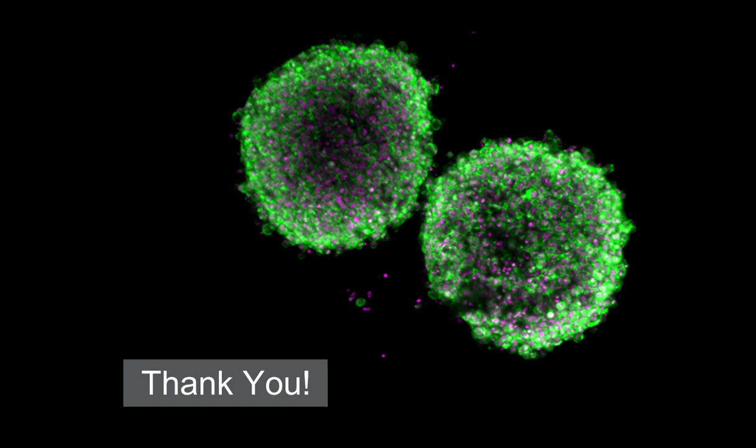Yeah, thanks, Christy. Another good question. All of the different assays, reagents and dyes that we've discussed are things that we'll need to add to our cells, and in many cases we'll need to wash our cells, or in some cases fix and perm. These are all things that require media changes and manipulating our cells.